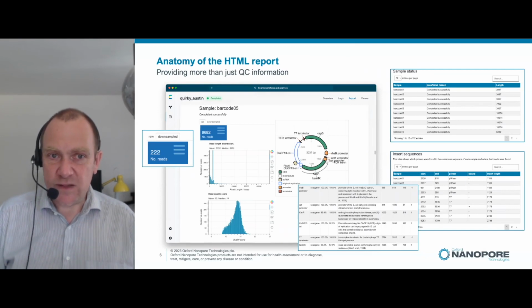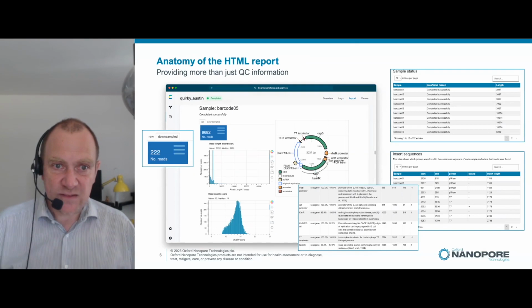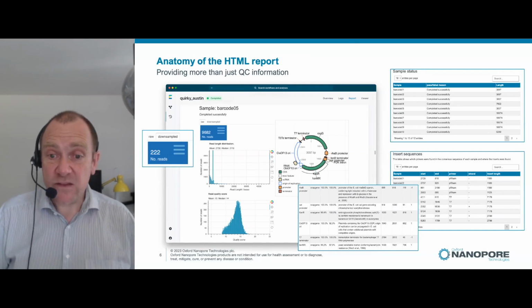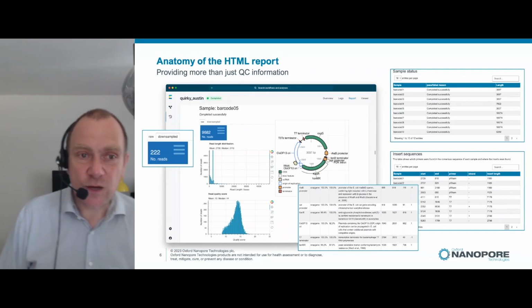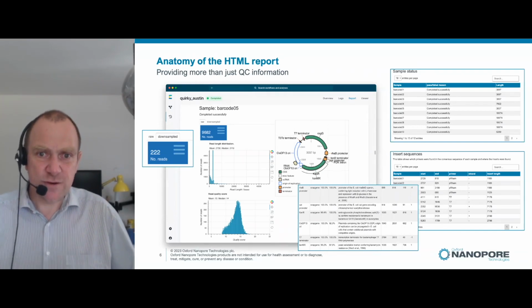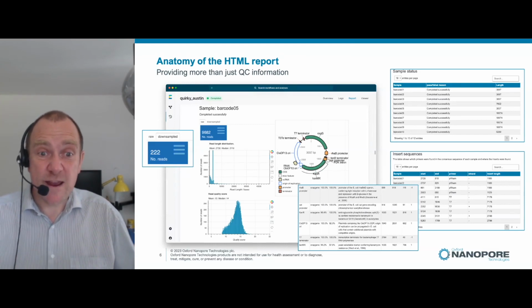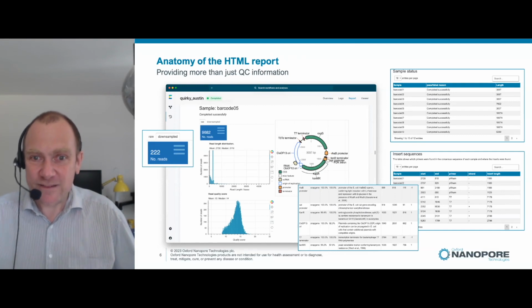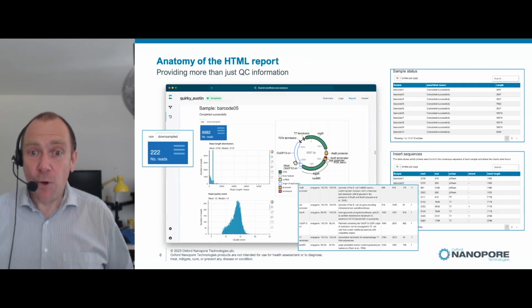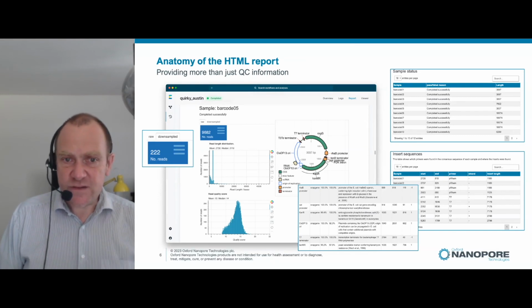In this case, we can see that for barcode number 5, there were just less than 10,000 starting reads, but by the time we had performed the downsample, the number of reads that we selected was actually only about 250 sequence reads. This shows that for a successful recovery of a plasmid sequence, we do not really require thousands or tens of thousands of sequence reads. A modest number of reads is sufficient. In addition to the infographic, we present tables of information.